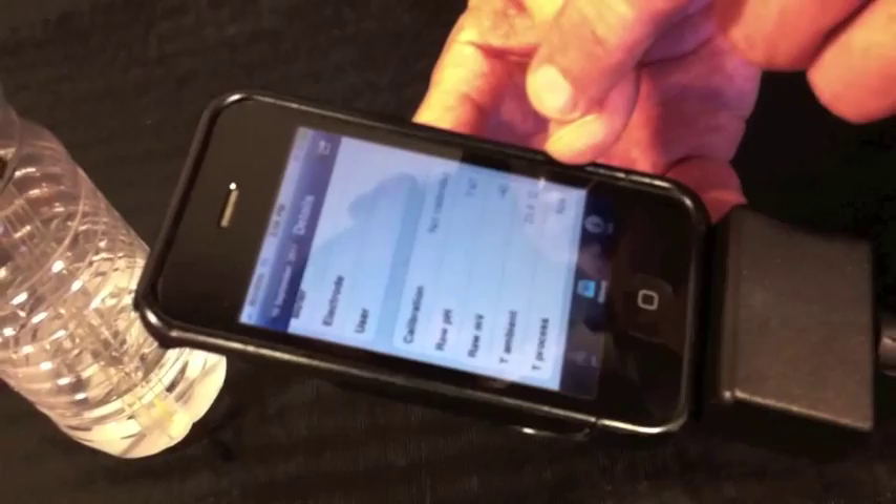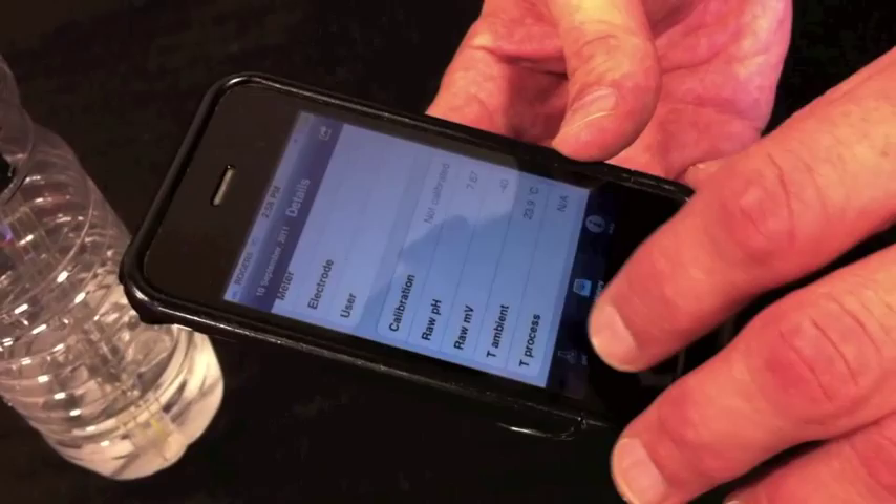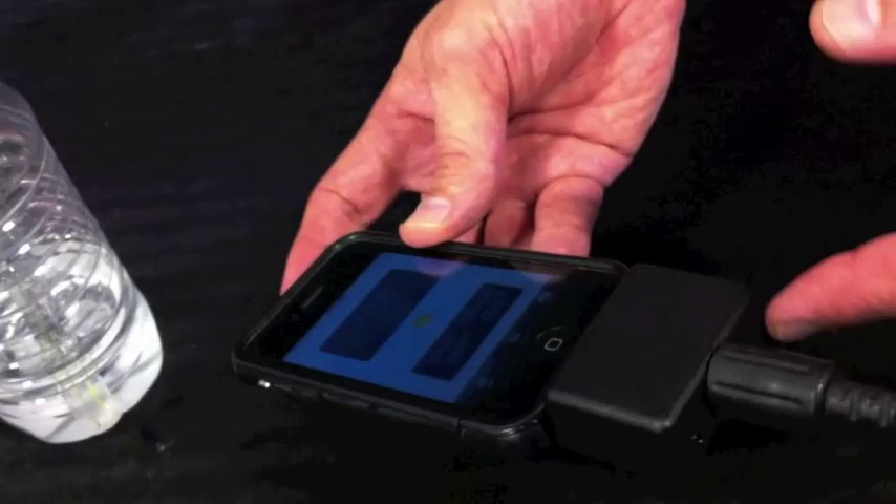Now because PH is a temperature-sensitive measurement, the unit accepts also a temperature plug. This is specifically for PH — I couldn't use this on my holiday turkey? I wouldn't recommend using this on your holiday turkey.